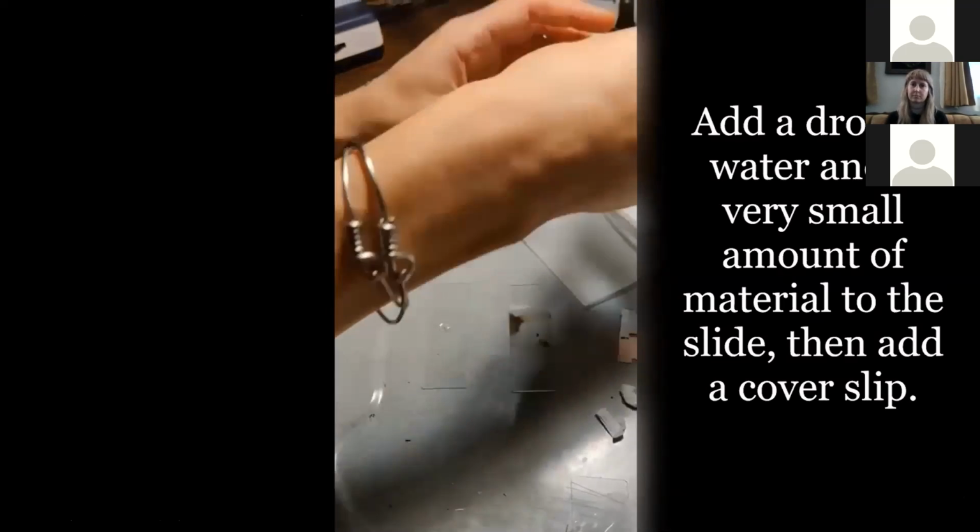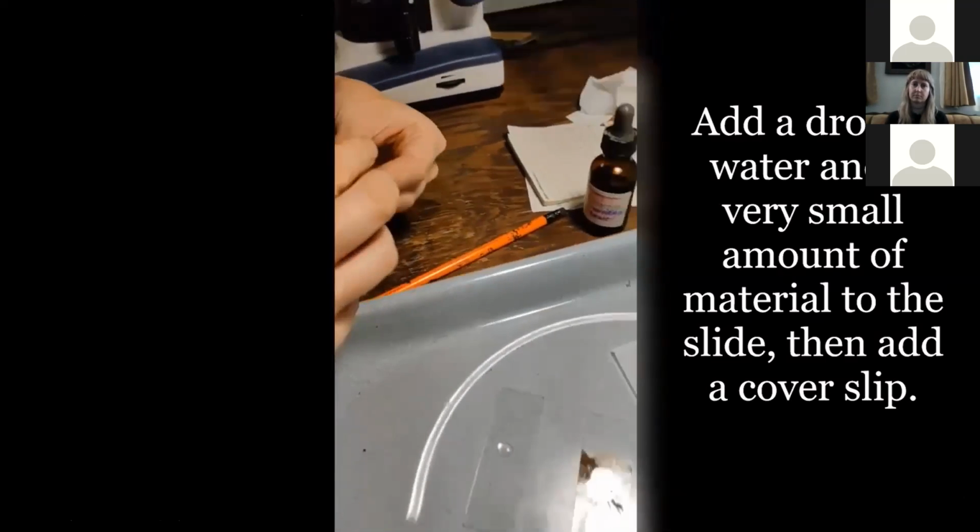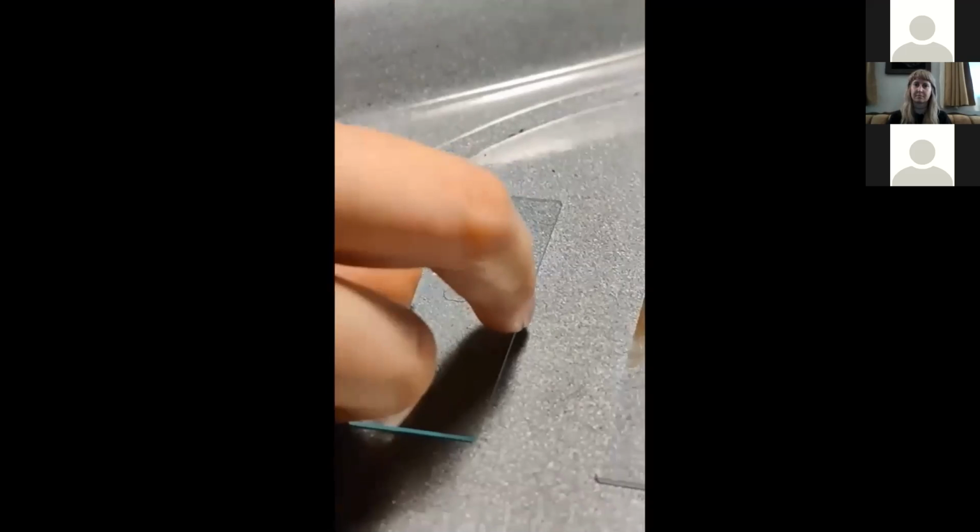Okay, and then I'm going to get out a cover slip, trying not to touch it too much with my hand. Just one. They look a little dirty, so I'm going to clean it with my shirt a little. It's probably fine. And then I place it on here. Okay, and if there was more material on this, like a bit of mushroom flesh, I might squash it a little bit by using the end of the pencil, not my finger, so I don't get my finger grease on it.